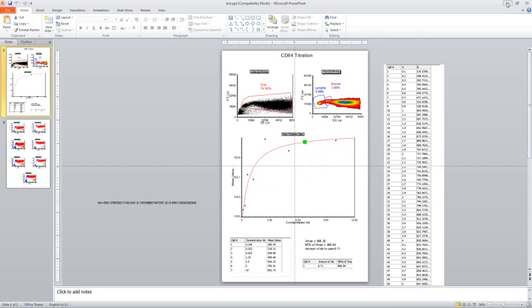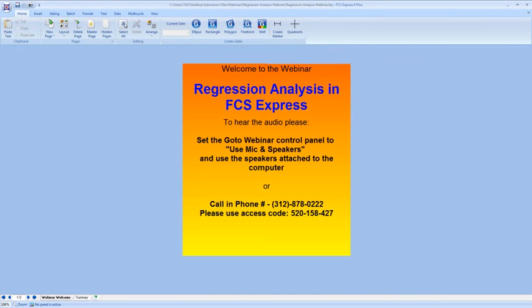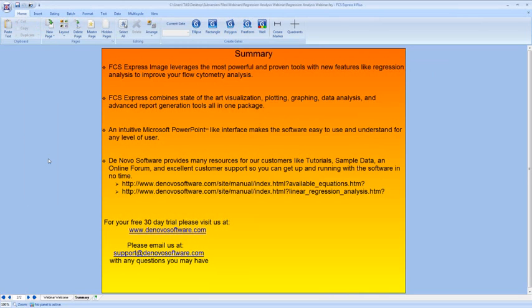So at this point, I kind of want to open up the webinar to questions as we're coming to the end here, and I'll bring up our summary as well. So if you have any questions, please type them into your questions box, and I'll just go over the summary real quickly while you're asking questions if you have any.